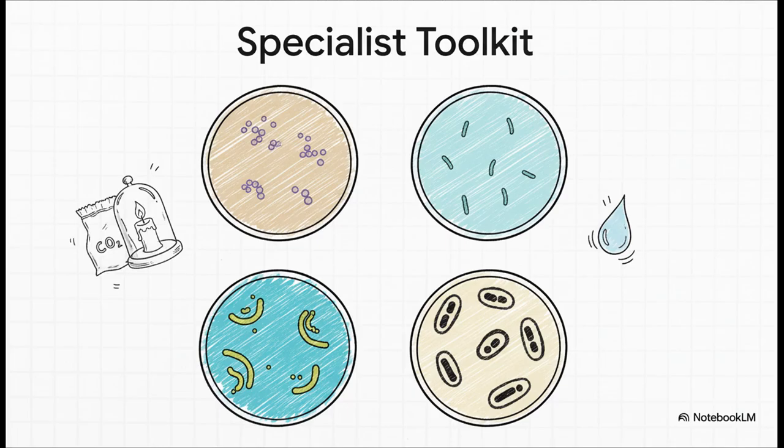So what happens when your standard plates come up empty, but the patient's symptoms are screaming a specific diagnosis? Well, that's when you reach for these special tools. If you suspect Neisseria meningitidis, you grab a Thayer-Martin plate. For weird pneumonia, you might use BCYE agar to hunt for the elusive Legionella. Each one of these is a highly specialized trap designed to catch a very specific bad guy.